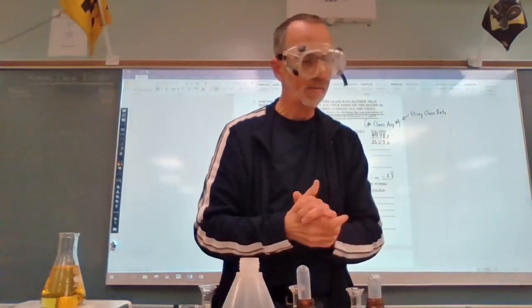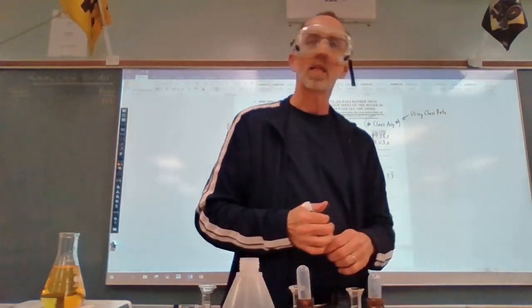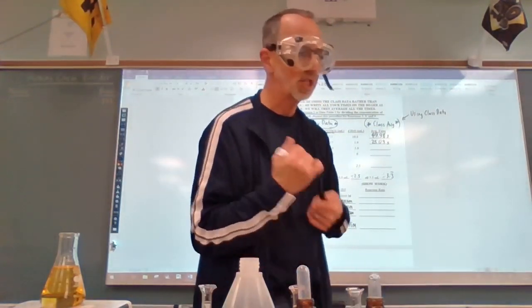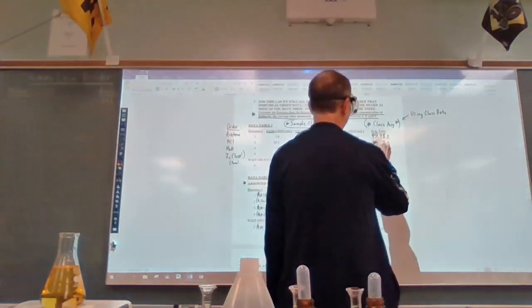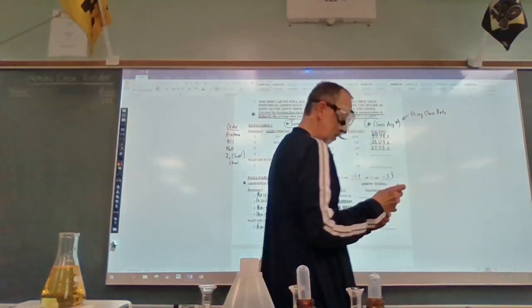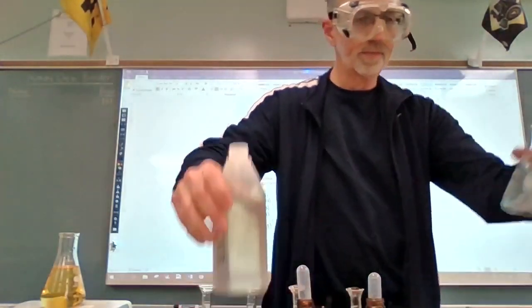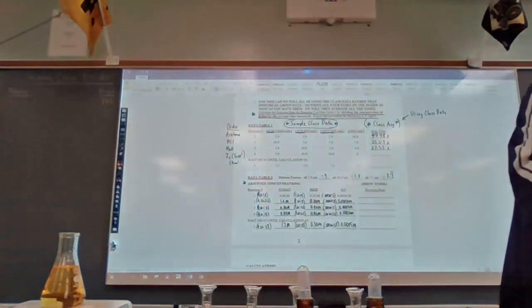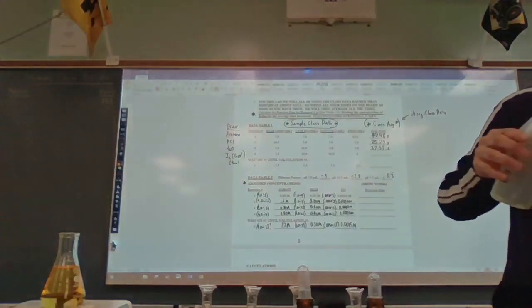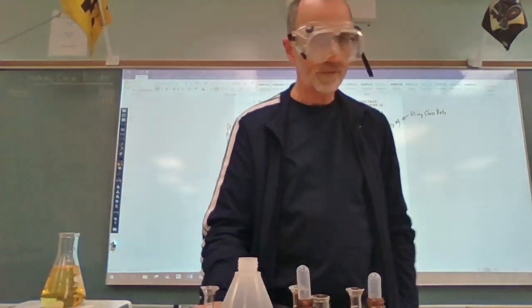Okay, mine, I got about 28.57 seconds. Class data for last year averaged out to 27.55. I was only a second off. Not too bad. All right. So let me rinse this out, and we will get ready to run reaction 4.